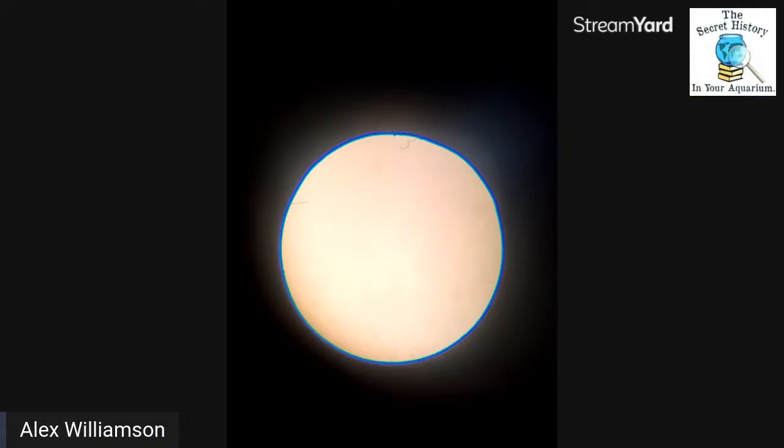Well, I better give you something to look at. Let's give them something to look at. All right. Let me take a sample. Let's start off with the exciting junk, okay? So I'm going to take a sample here of what we just pulled out of the aquarium outside, or the tubs outside, rather. We're going to take a look at that.